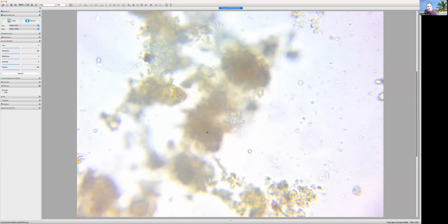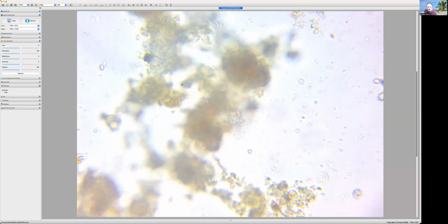This is going to be my top view microscope camera. Okay, I think this should be... Oh, what do we got moving right in here in the center? I'm going to get my annotations up. Something fairly big here.